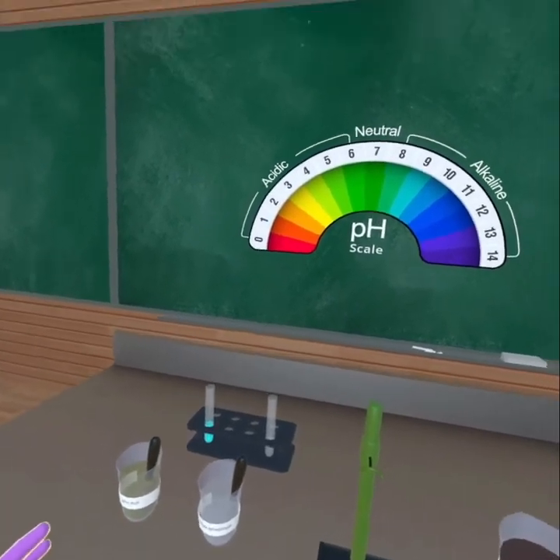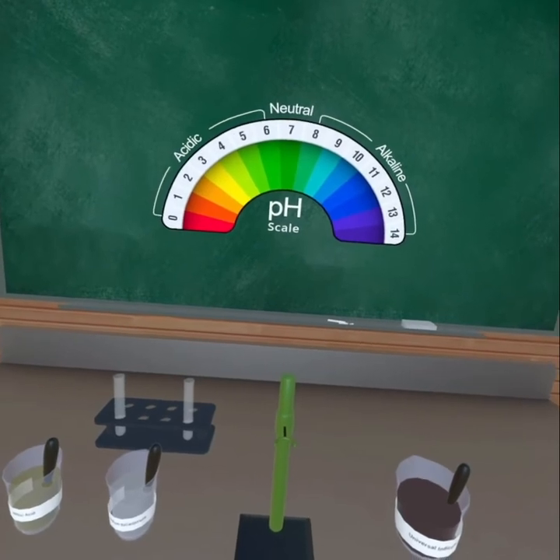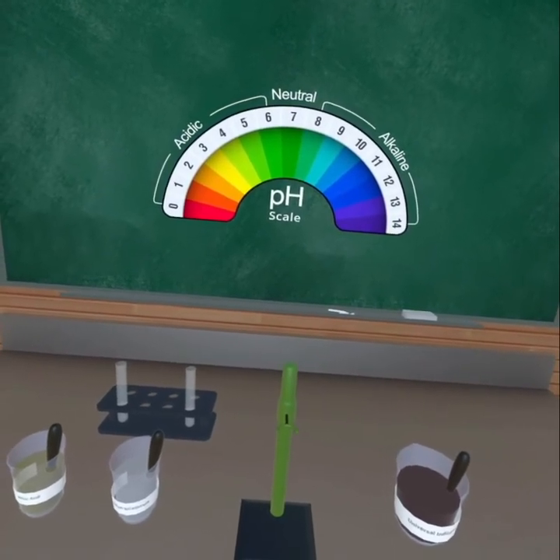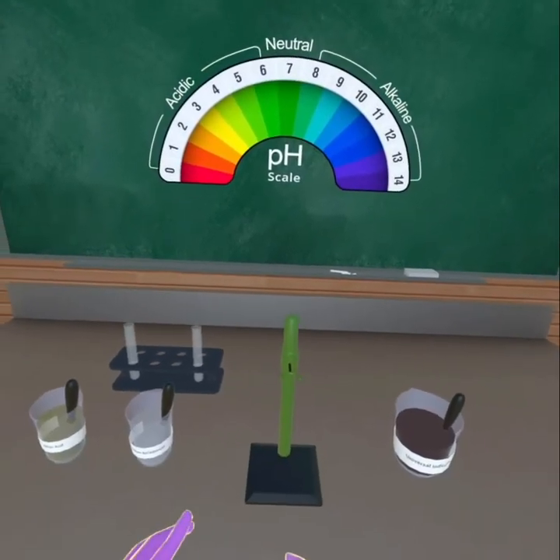Great work! Let's test what you have just learned in this experiment. You will be scored for this part, and I will be here if you get stuck. But you will lose points if I have to help.